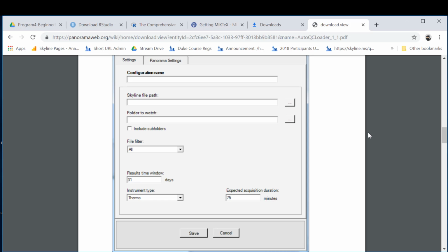The question was whether I can check in from several profiles, watch several folders. You can have multiple profiles checked. We only ever have one checked at a time, though. I think it probably would work. I can't imagine why it wouldn't if you had multiple checked. As a separate option, if I had one LCMS that was capable of doing nano and high flow, so I had two separate data sets, that could be two separate profiles. Yep, I would have two separate profiles for that, and I would probably have two separate Skyline documents for it.